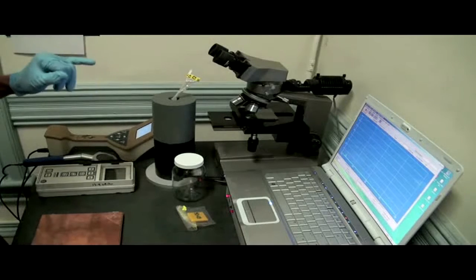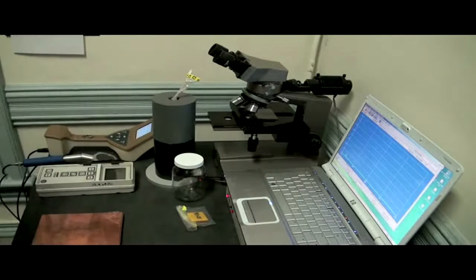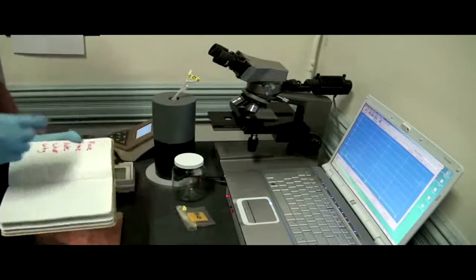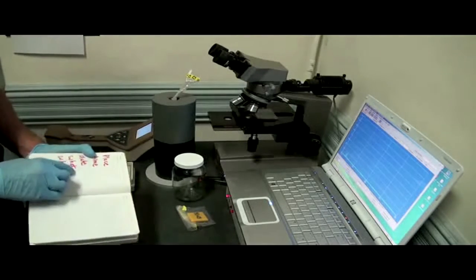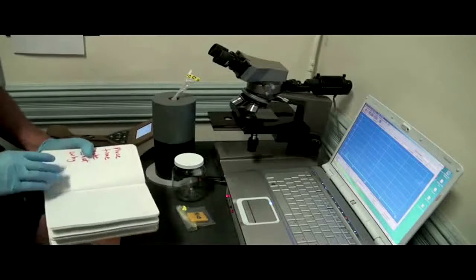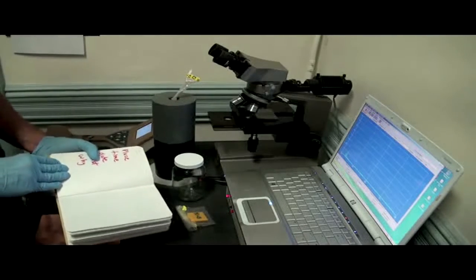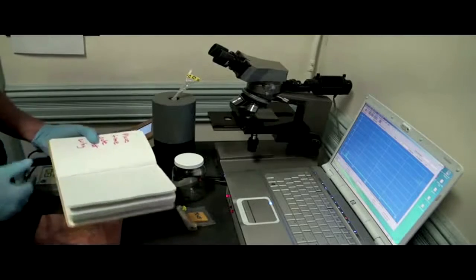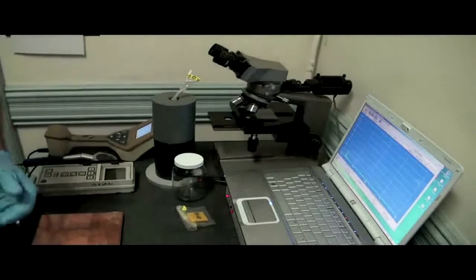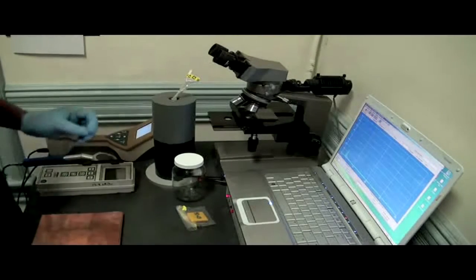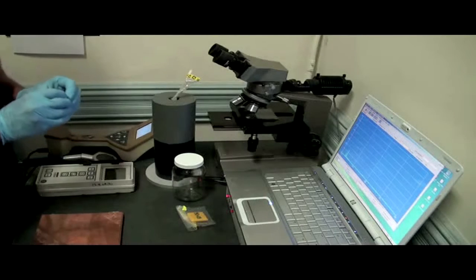You can see there are a few things that we need to know about that right away. And I'm going to go back, place, time, date, what the sample was, why you took it. And for a vacuum cleaner bag, we're also talking about the address, maybe even the residence in the home. I'm going to write all this information down and make sure that that travels along with our sample.